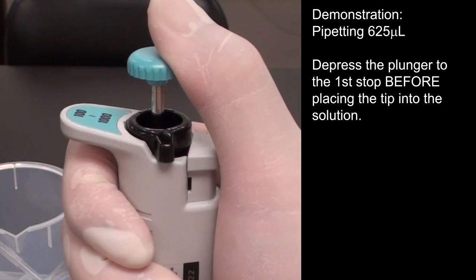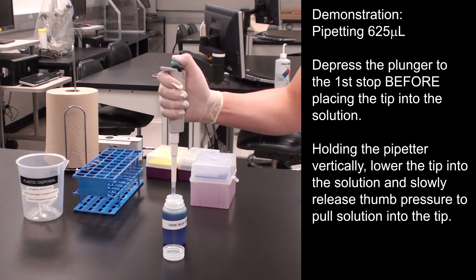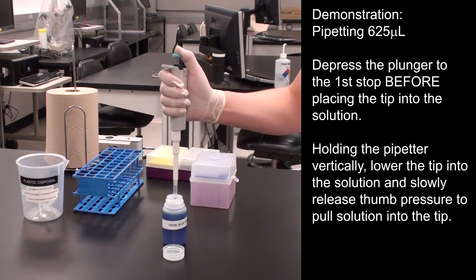Depress the plunger to the first stop before placing the tip into the solution. Holding the pipetter vertically, lower the tip into the solution and slowly release thumb pressure to pull solution into the tip.